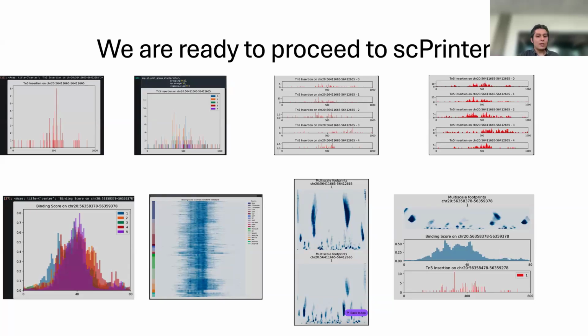So then I always thought the x-axis was base pairs. It is. Okay. Yes. The x and y axis are both base pairs, but one of them is the base pair of the DNA binding region, and the other is the size of the footprint left by the DNA binding protein.